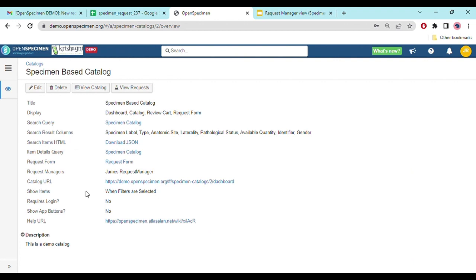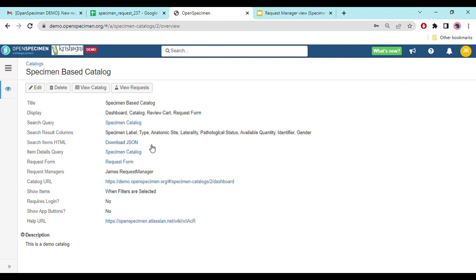Once I click on the catalog, I can see different details on the overview page. Here I can edit, delete, view the catalog, or view requests using the buttons on the display page. You can see the title and other details such as what type of query is used under the catalog, the catalog URL, whether it's a public or private catalog, and the request manager that has been configured.